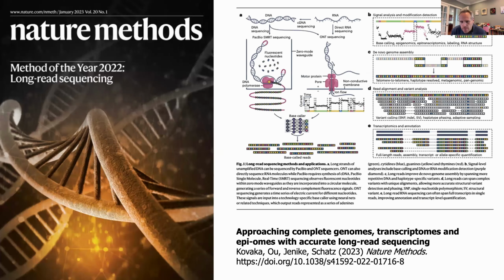Now, they've been known about for a long time, but the field has really changed in the last few years, right? A couple years ago, Nature Methods declared long-read sequencing the method of the year. We wrote a review article capturing that we're really entering this era where we can have complete genomes, complete transcriptomes, complete epigenomes, thanks to this really accurate long-read sequencing. And in terms of accuracy, HiFi sequencing today is the undisputed champion. You just get excellent quality from the data.